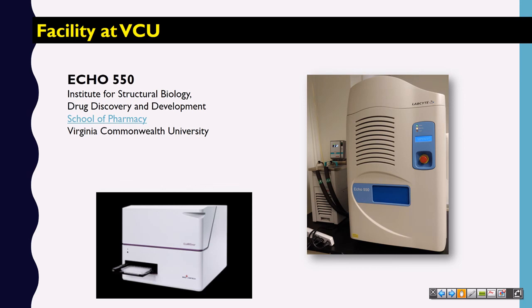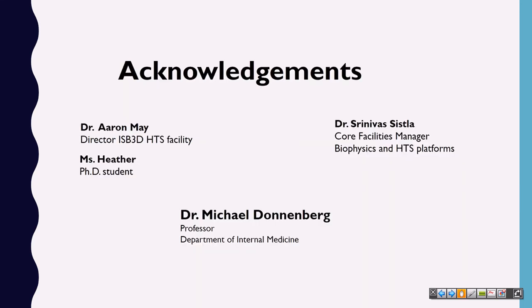And this instrument is present in our VCU facility. So this is the Echo, and I'm also showing the CLARIOstar, which is the fluorescence polarization spectrophotometer. And yeah, that's all. This is all about the presentation.